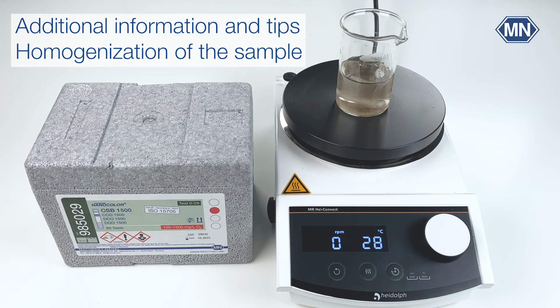A common source of error is improper homogenization of the sample. Samples for COD measurements often contain large amounts of particles, especially in the inflow, which can lead to fluctuating measurement values. Make sure to homogenize the sample properly — this can be done with a magnetic stirrer. If you have larger particles in the sample, you can use a high-performance disperser.